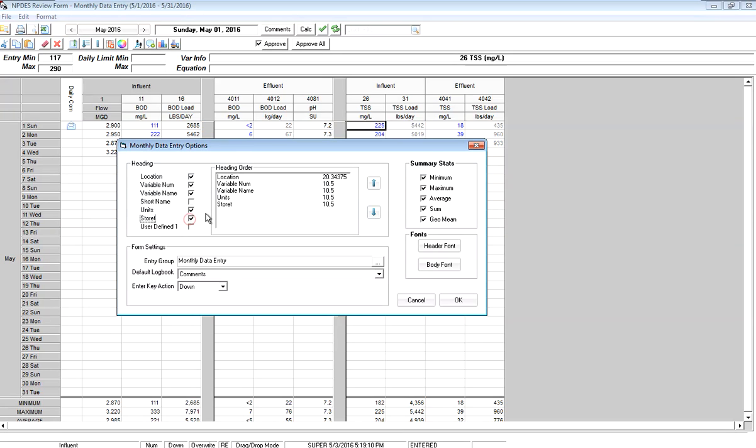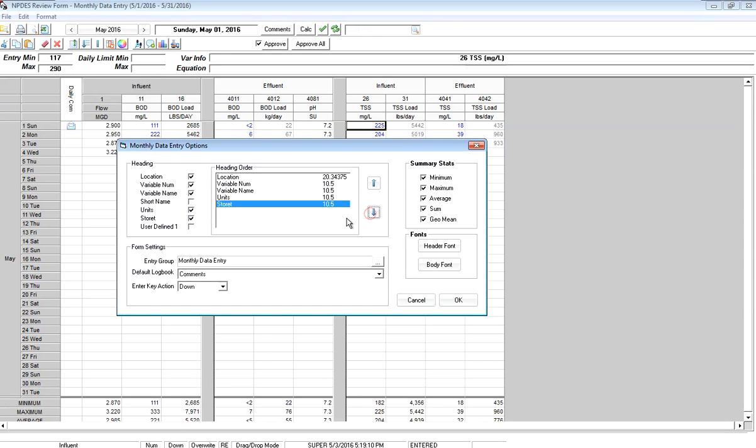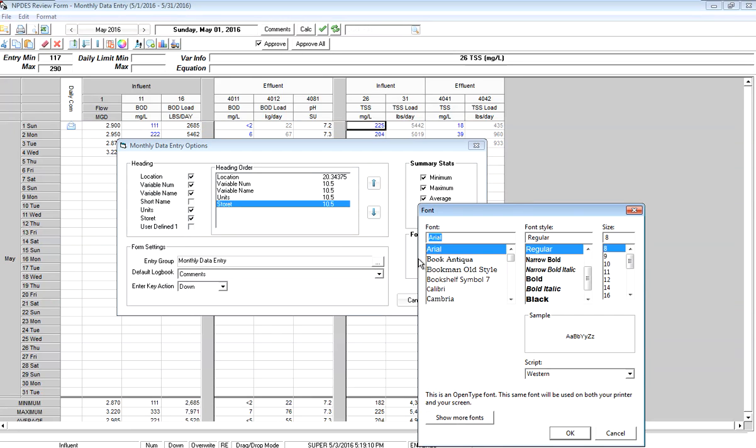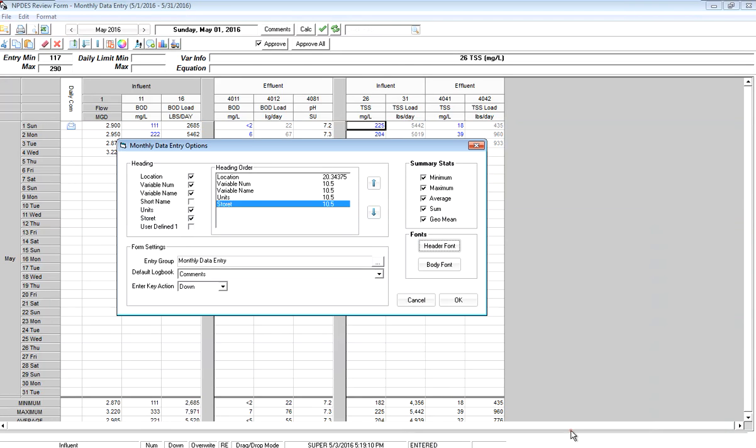If I want to move that up or down, I can do that. Right here, I can also change my header font. I want to make it look a little darker, so I'm going to make it 9 and bold. Click OK.